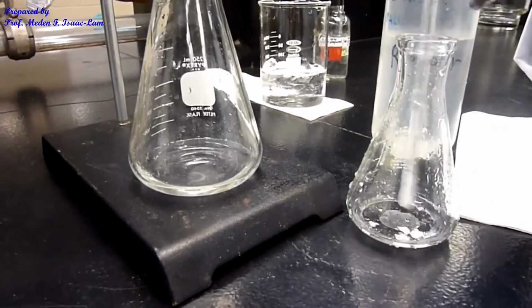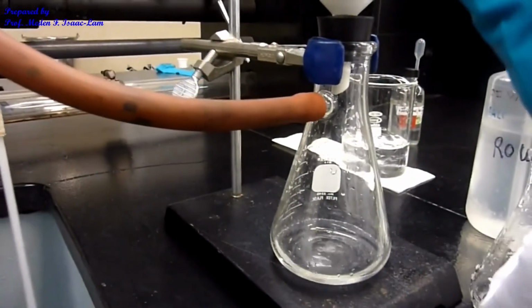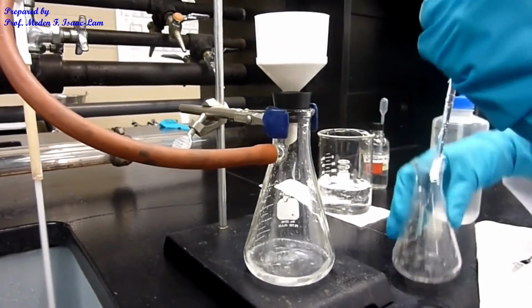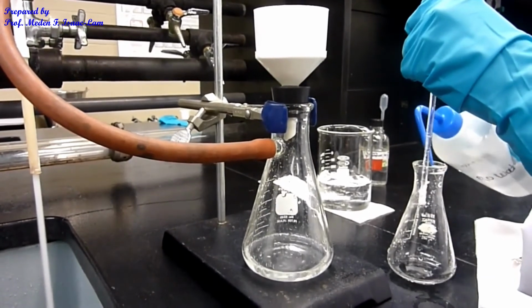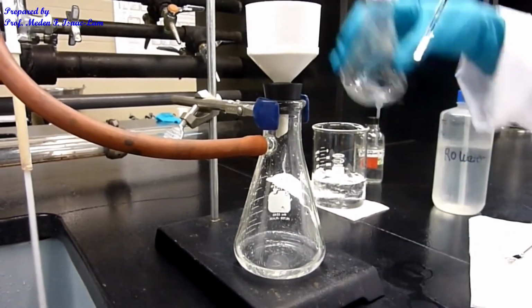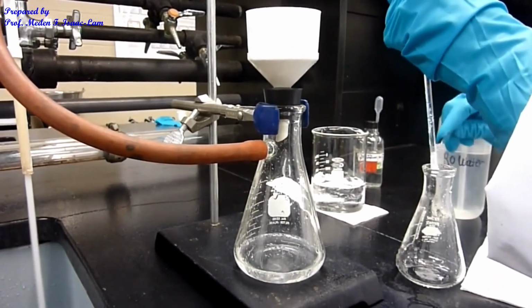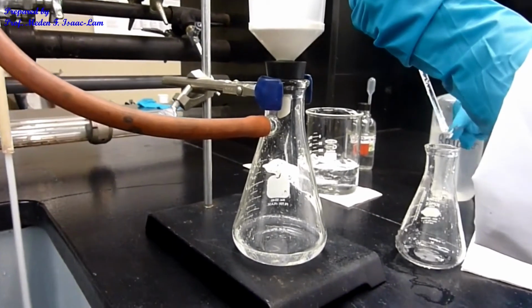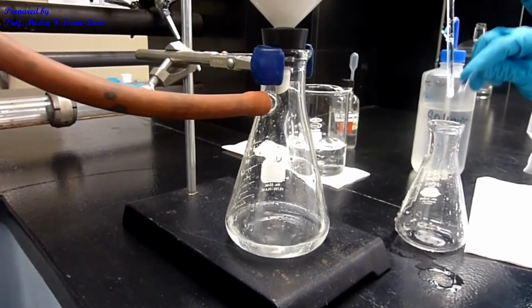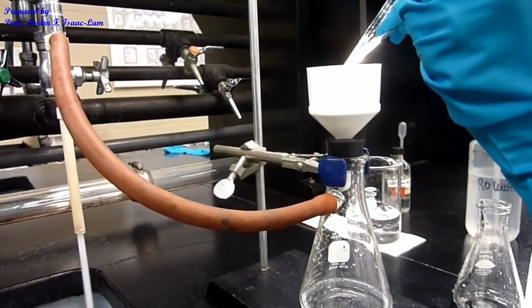So it's wet, it's sticking. I'm washing it with quite a bit of ice cold water.